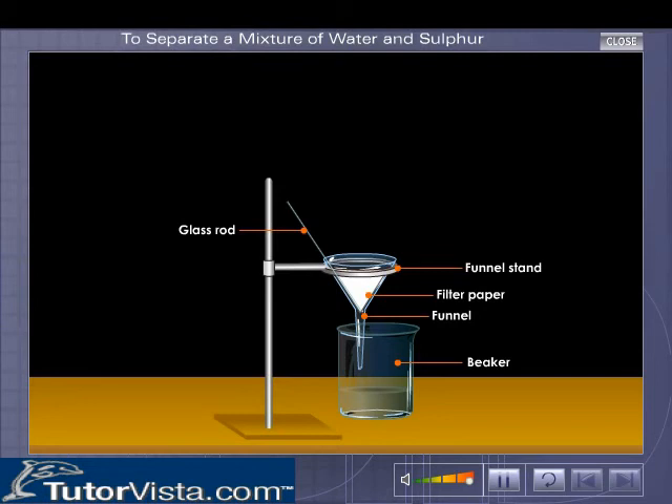The liquid collected in the beaker is pure, clear and free from sulphur. The clear liquid obtained after filtration is called filtrate.